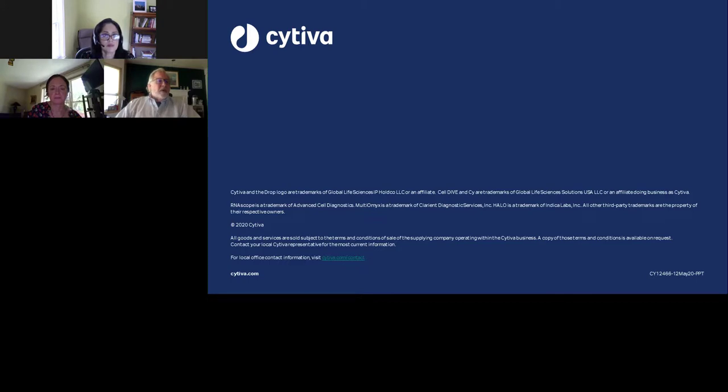So I'll take one more. There's the question of how the inactivation of the dye molecule transpires. What goes on there that deactivates the fluorescence molecule? We use a mild oxidation method with cyanine dyes, cyanine backbones, so Cy dyes are compatible with this oxidation process, and that oxidizes and destroys the dye within 15 minutes or so. So it's pretty quick and mild on the tissue.